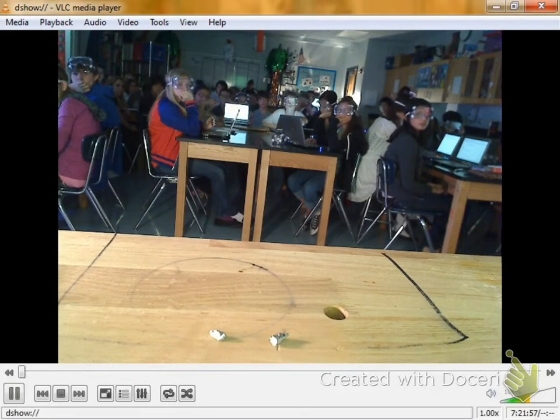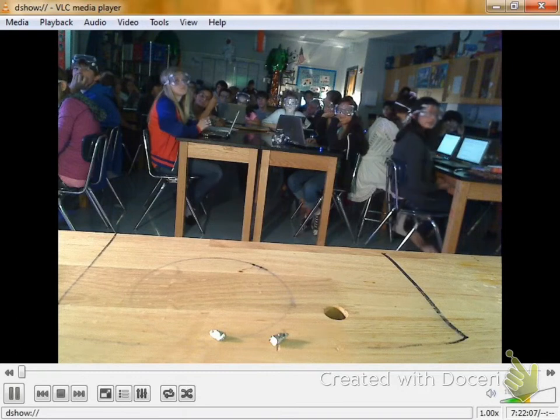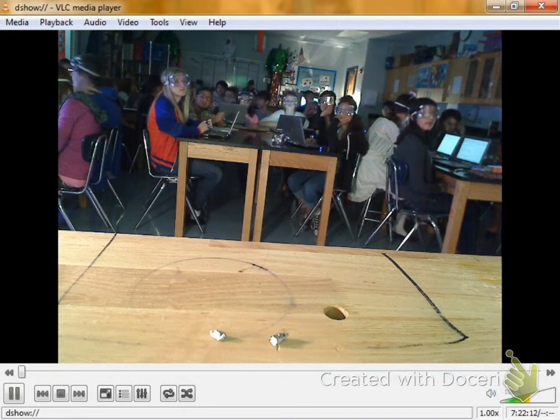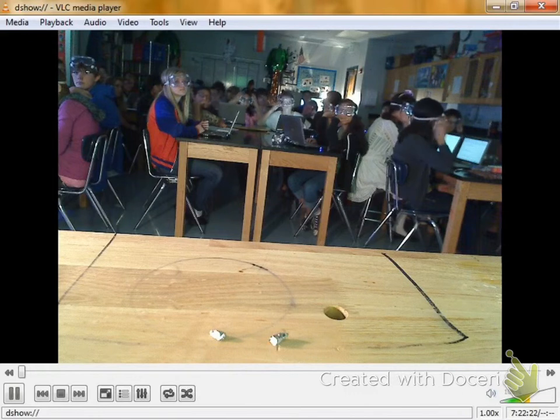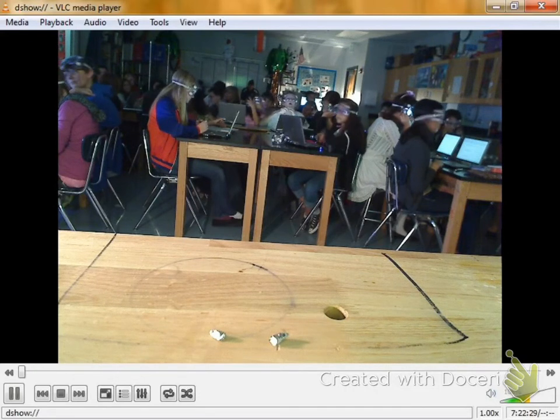On a scale of 1 to 10, what would you say my effort level was to cut the calcium in half? 3. I'd say like a 3. We're going to say make 10 the hardest and 1 the easiest. 2. I'd take a hammer and a screwdriver. I mean, if I take the hammer and screwdriver to this card here, am I going to knock it apart? No. So it's probably not a 10, but I did take a hammer and a screwdriver, so are we really going to call it a 2? 5. Yeah, I like the 5. Let's call it a 5. We'll put it right in the middle.